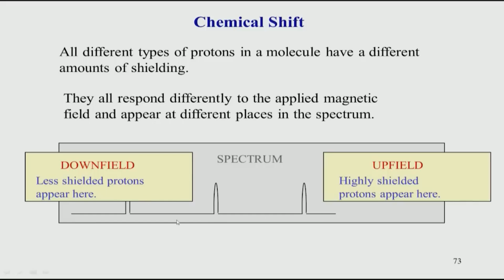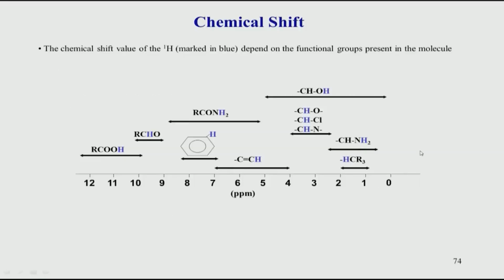If you look at the spectrum, the ppm starts at 0 somewhere here and goes from right to left. So, the ppm scale always goes like this. This is a higher ppm value, and as I go to the right side, the ppm value is lower. The lower ppm value is denoted as upfield shifted, and the higher ppm value is denoted as downfield shifted. The chemical shifts for different functional groups come in particular zones. This is a hydrogen spectrum, a proton spectrum.